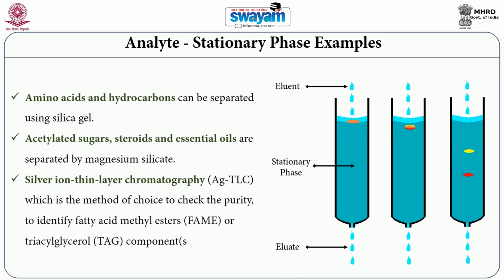Inorganics, as we said, are separated using TLC. Now, stationary phases are also available for racemic compounds and sometimes are used for separating enantiomers, such as for macrolide antibiotics, as a quality control procedure to check for the purity and to see the different compounds, say polyphenols, etc. So they are used not only for chemical compounds which are very distinctly separate, but they are also used for racemic compounds and enantiomers.